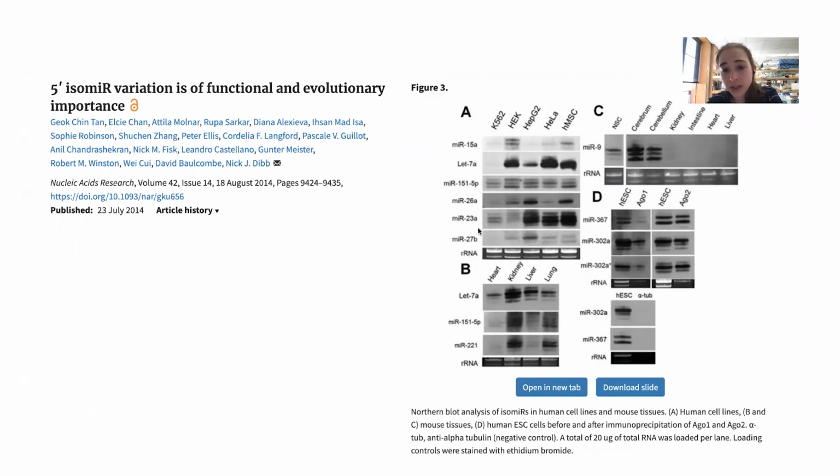And also, if you are just looking for a specific sequence, you can miss variations in the sequence. If you're doing a qPCR, it's a yes or no: is this particular sequence here? But what if it doesn't tell you about what's next to the sequence? If modifications are put on afterwards, like for these microRNAs, sometimes they get tailed, sometimes they get trimmed.